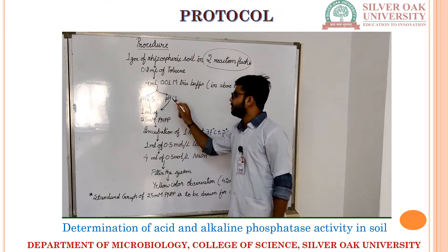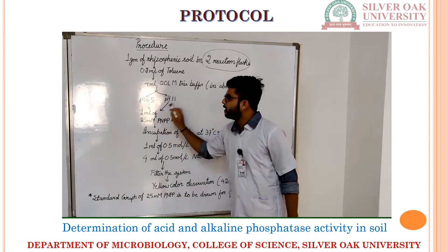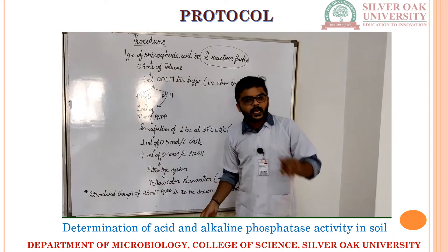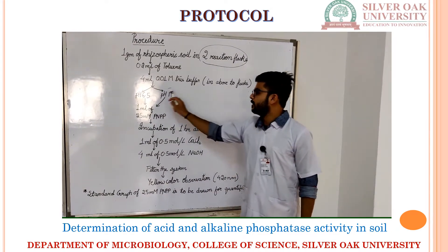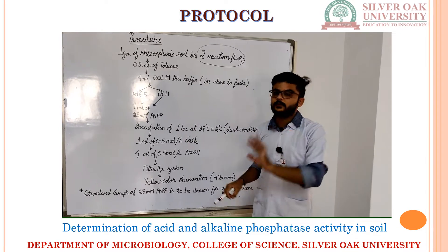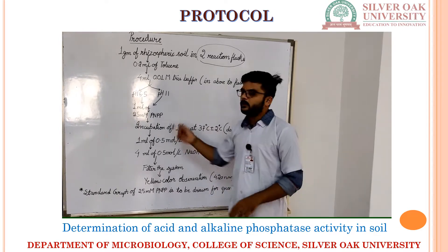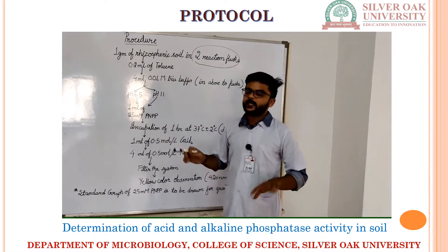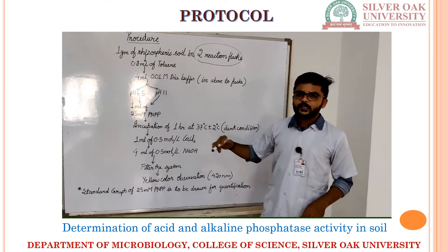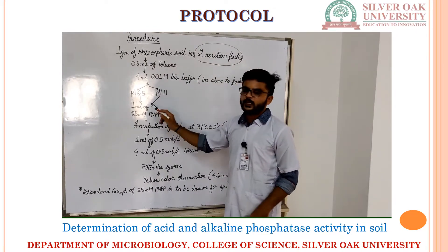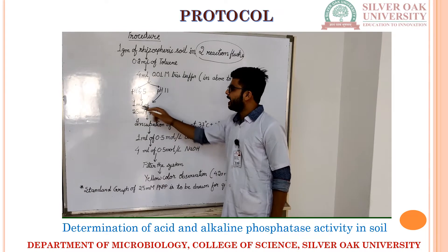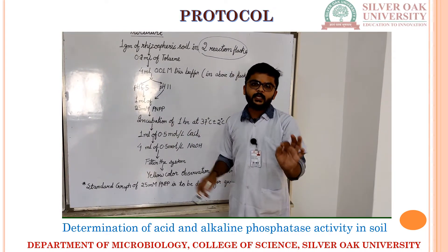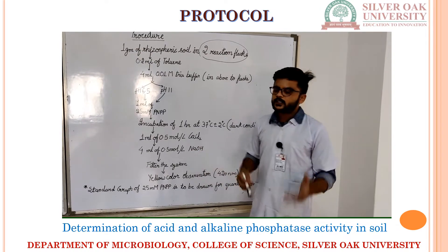In one flask, we will be taking trace buffer having a pH of 6.5, and in another flask, we will be taking trace buffer having a pH of 11. These will be used for acidic and alkaline phosphatase respectively. After that, in both of the reaction flasks, we add 1 ml of 25 millimolar p-nitrophenol phosphate, which is our substrate.